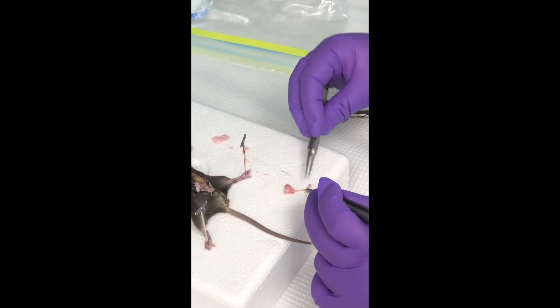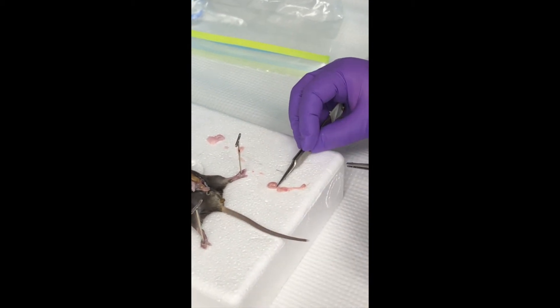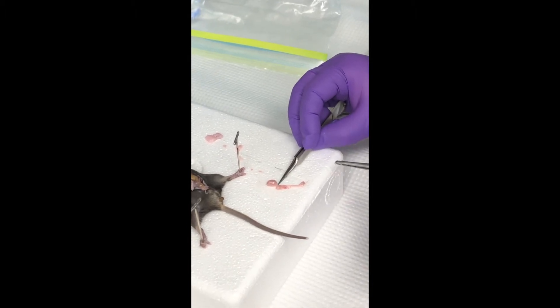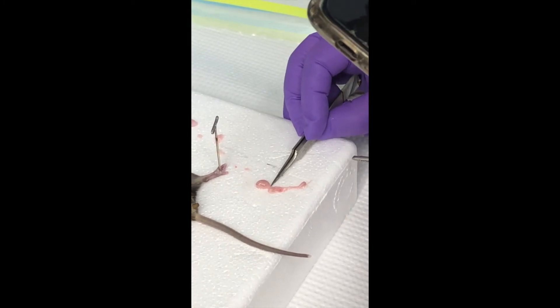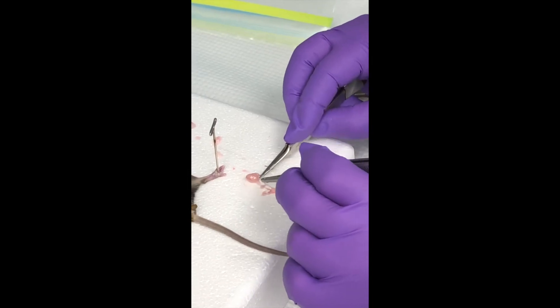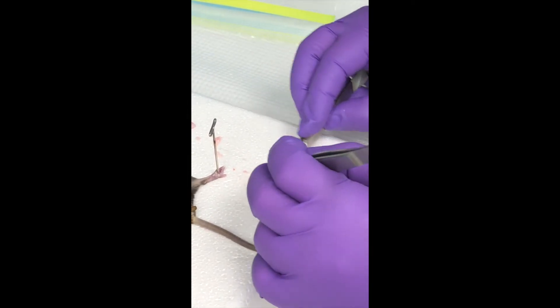I'm going to put it in a separate block this time. And then you see right here? Get another picture right there — that's where I want it. So this is the epididymis, and that's the last cut I need to make right there. That's probably the hardest cut to make — it's very ligament-y.